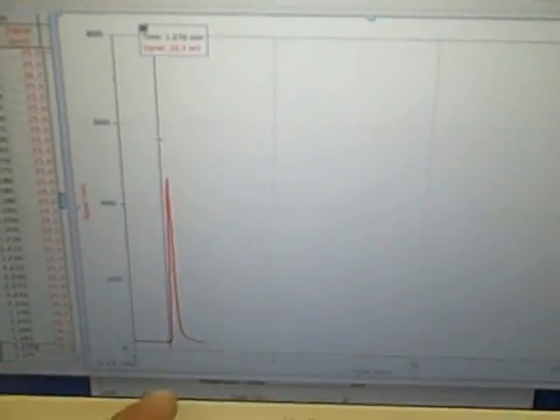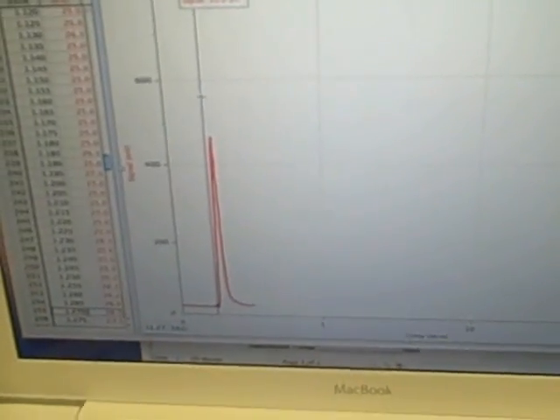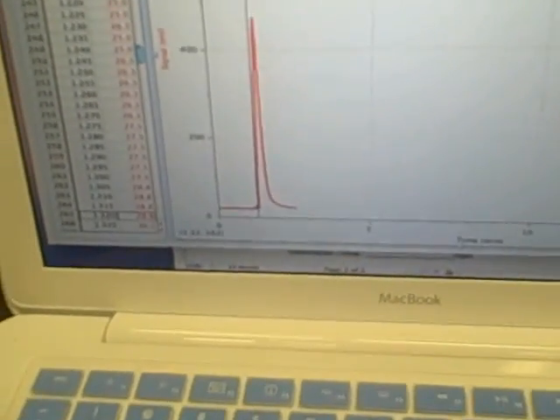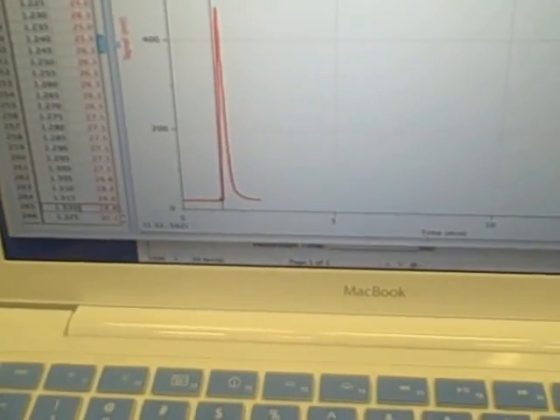The peak retention is at 1.47. If we look at the bottom of the curve, we have another retention time. It begins going up at 1.32 minutes. Those numbers we need.